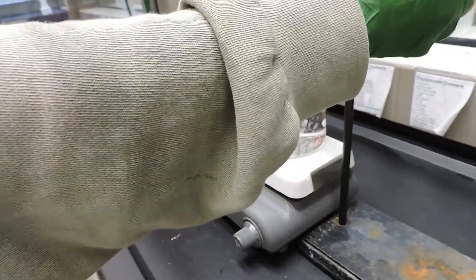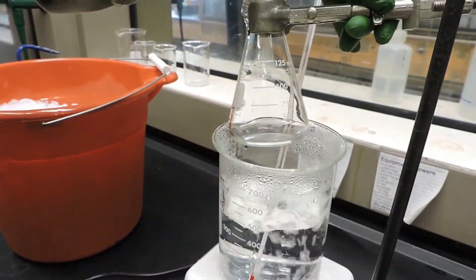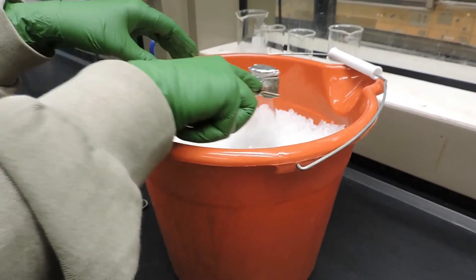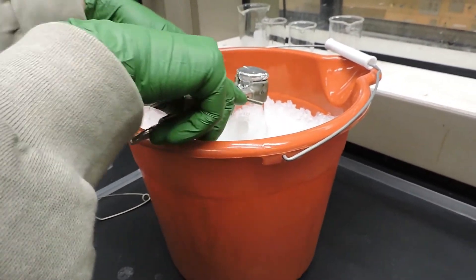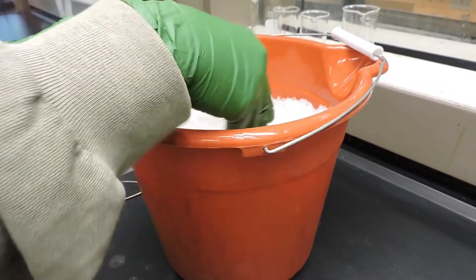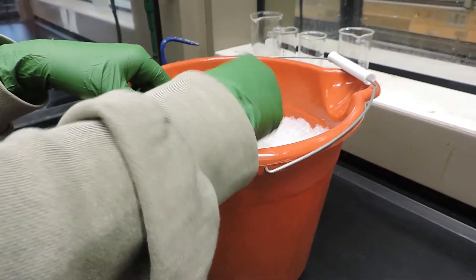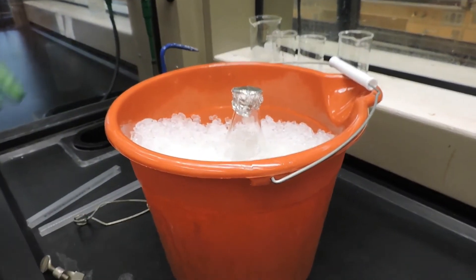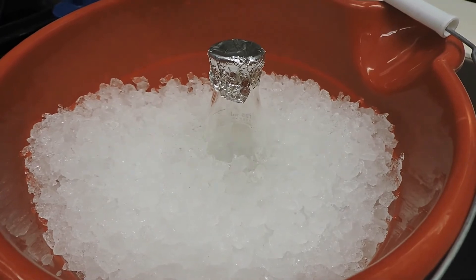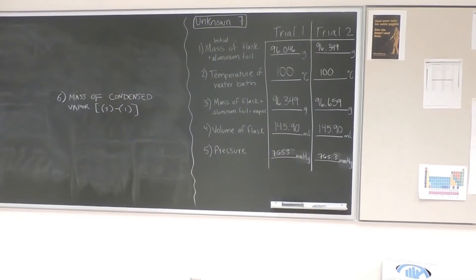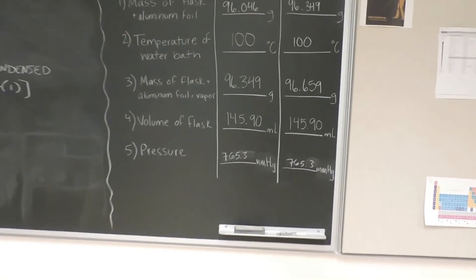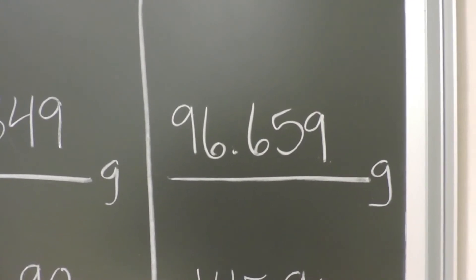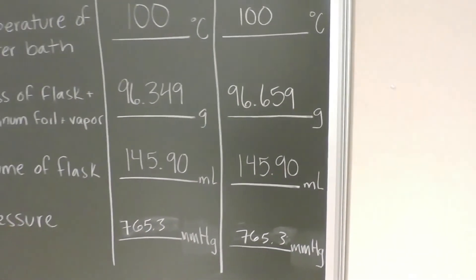All of the solution inside has now vaporized, so we're going to take out the Erlenmeyer and place it on ice to recondense the gas vapor. After we dried the flask from cooling, the final mass of the flask was 96.659 grams, and that is for trial two.